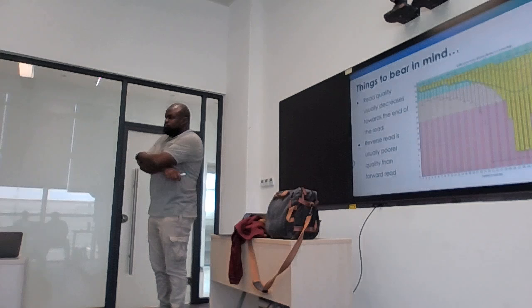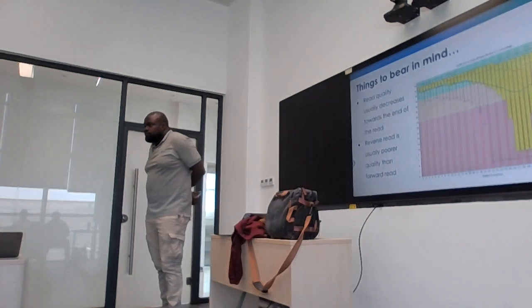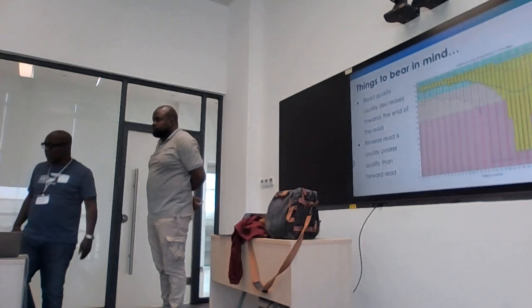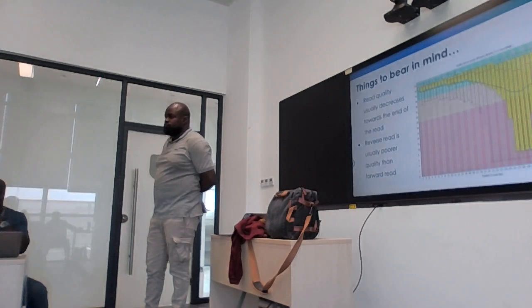Yes, I get that, but the other thing is that I believe that with every correction step we are not as accurate as possible. So when you have produced a fragment that is longer, the forward read will not cover every time. So that is what then comes in with the other side.